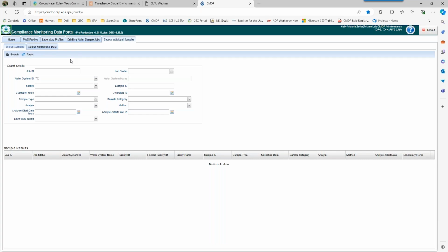So now that we've had an overview of the CMDP basics, I'm going to get into uploading samples using the CMDP web form. Before I start, are there any questions on the initial tabs of CMDP or any questions so far? No? Okay. I don't see any questions. All right, thank you.